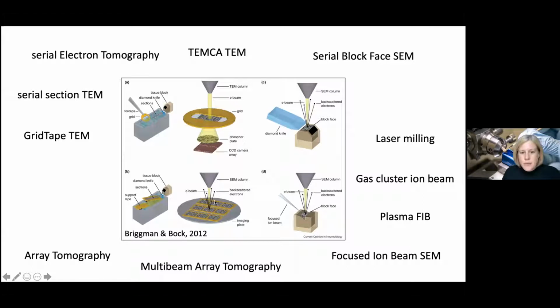So this is where the wafers are put into a scanning electron microscope and imaged with the electron beam, which is split into multiple parallel electron beams, which means that you can image a large field of view, but maintain very high lateral resolution. And then we have various associated techniques. And one of the main ones is correlative imaging.